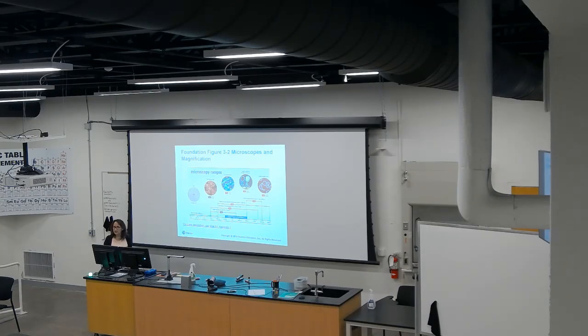It's between 6 and 8, okay? And then here we have E. coli bacteria that, if you extrapolate this bar scale by length, will be more or less 2.5 micrometers, and by width, a little bit less than 1 micrometer.